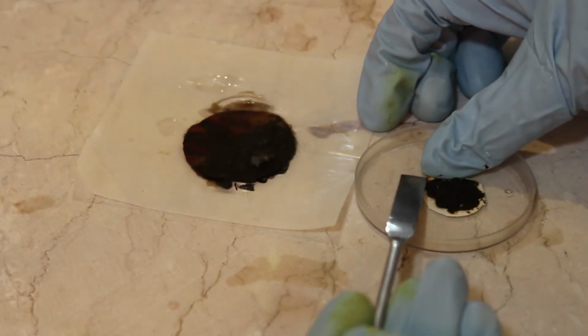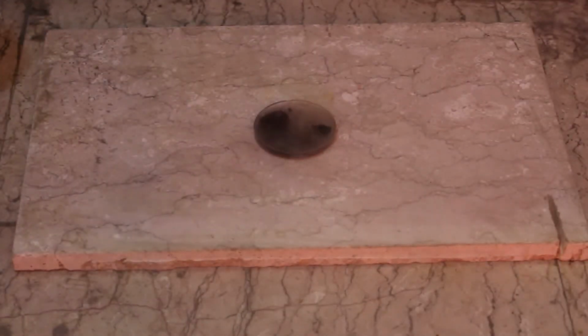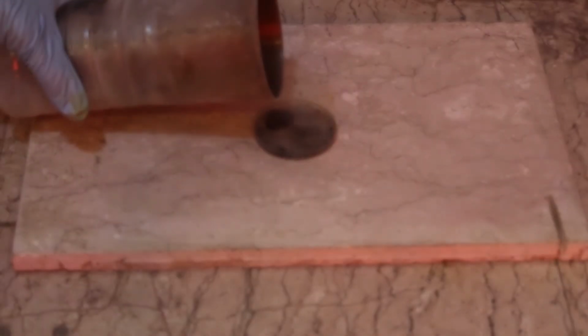Due to the explosion aftermath, the container shouldn't easily break. I started pouring the liquid nitrogen inside the container. You can see that some of the nitrogen triiodide particles ran off the container. They just acted like small piles of nitrogen triiodide when dried off. I poured some more liquid nitrogen on it.